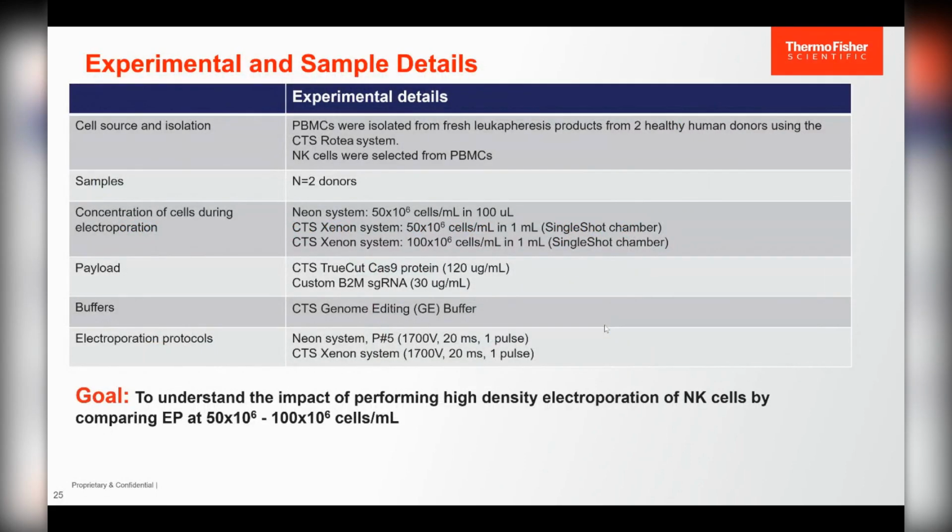Our goal was to understand the impact of performing high-density electroporation of NK cells by comparing electroporation at different cell densities, 50 million to 100 million cells per ml. And we can see the experimental details here.